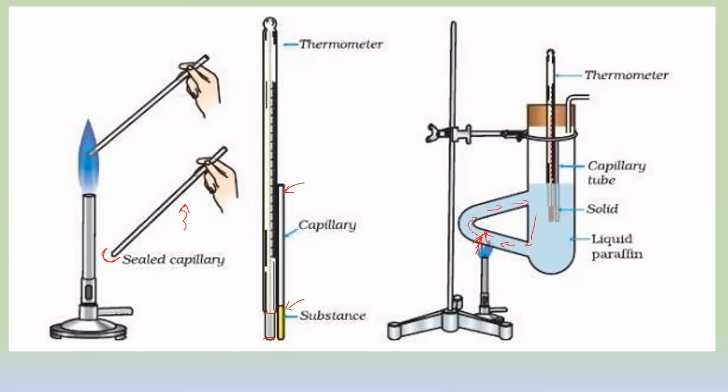The moment at which the entire solid becomes liquid, you will note it down as the melting point of your solid. Okay, I'm not going to give you the exact melting point, as we cannot determine it exactly by the practical experiment. I want you to search it. Search the melting point of benzoic acid online and write down that melting point in your experiment. Okay, so we have completed the experiment.